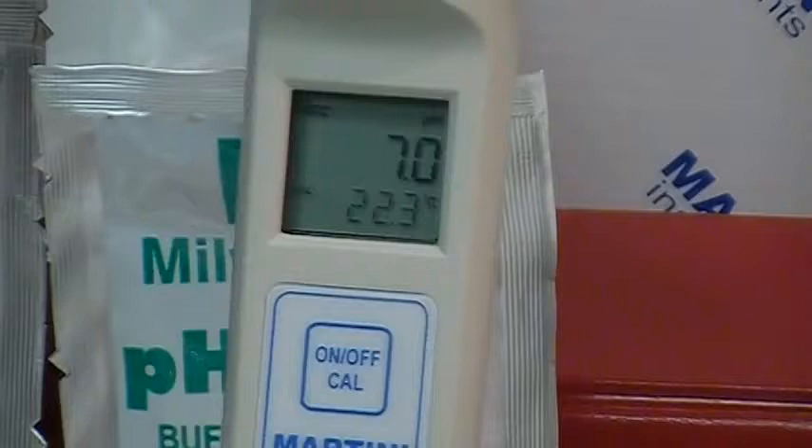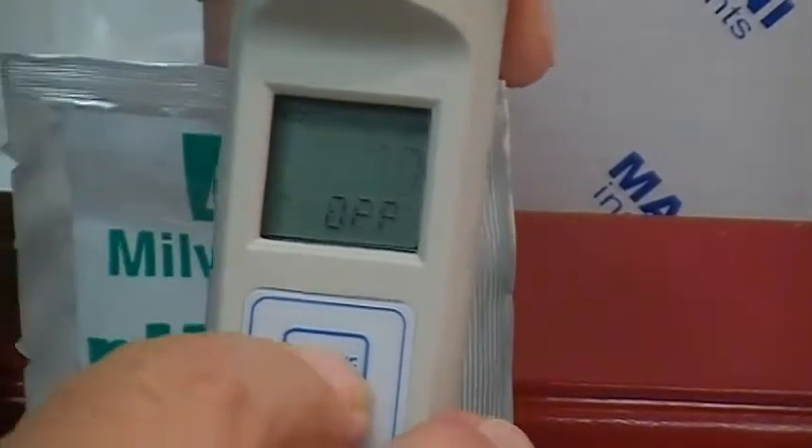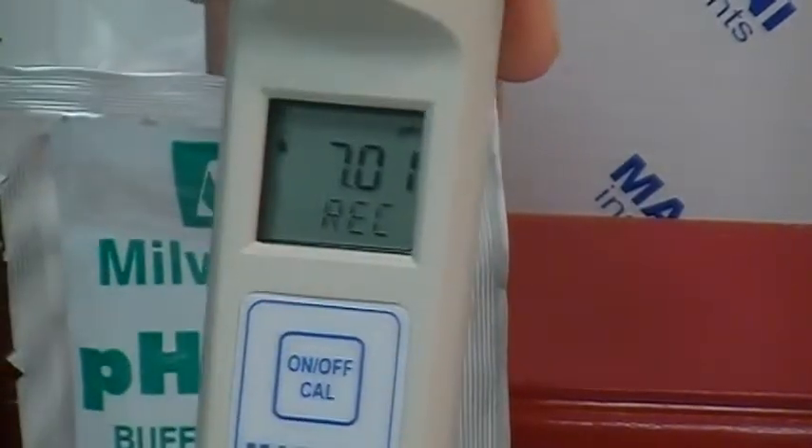When you're ready to enter calibration mode, go to the Cal on/off button, press and hold — you'll see 'off' and then 'Cal' — and release it.